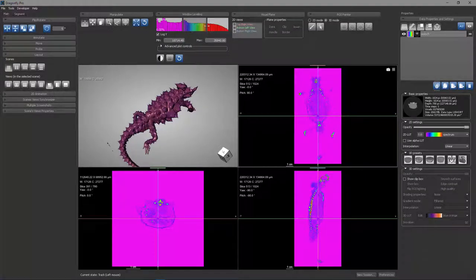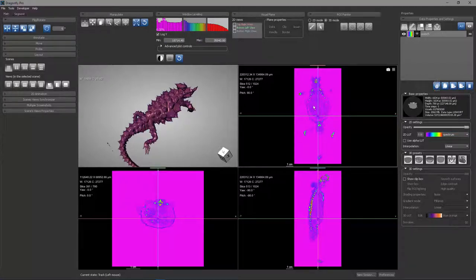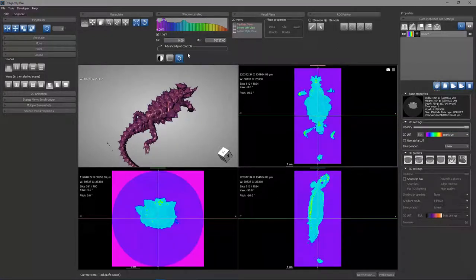So the combination of the window leveling settings with the lookup table affects your on-screen appearance. If I apply reset, it will reset the window.